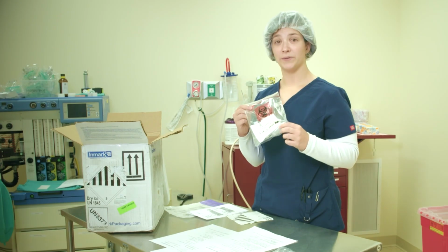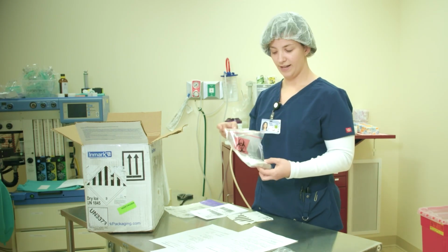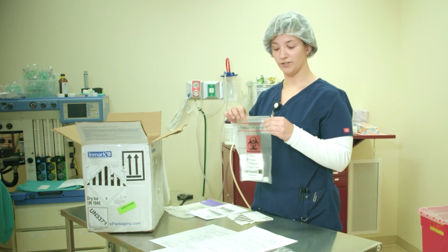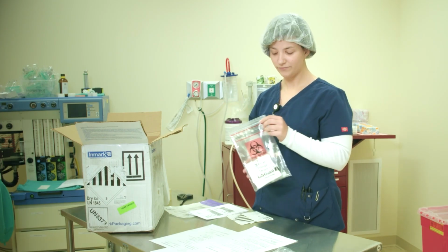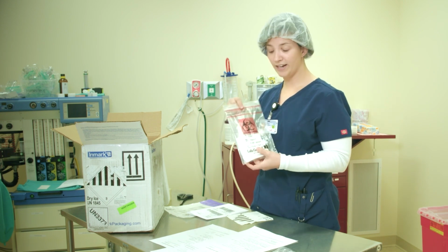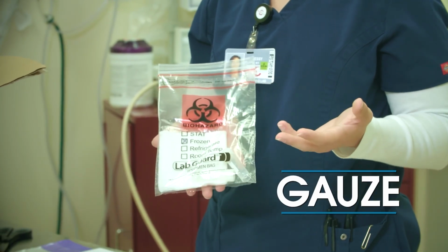The tube that the sample is in is called a primary receptacle. It has to be watertight. That will be placed in a secondary receptacle, like a biohazard bag, that is also watertight and sealed. Inside that bag needs to be an absorbent material. Right now I'm showing you gauze, but you could use paper towels or anything that will absorb anything that leaks.